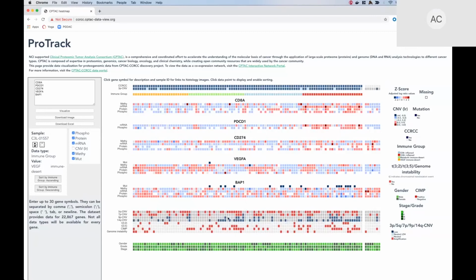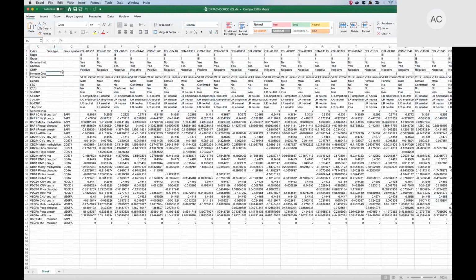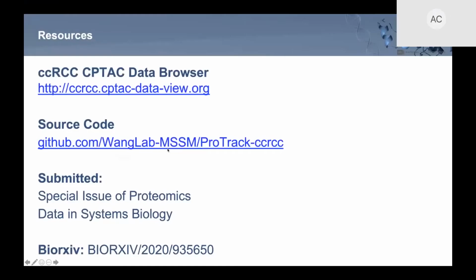And so this is ultimately an example of the very straightforward but hopefully very practical things you can do with this particular tool. Okay, so we've ordered this in a way that we find meaningful. If you download the Excel sheet, I'll show you what you actually get when you are trying to pull this data out. Specifically, you get those samples ordered in exactly the way that you determined was an interesting pattern for you. And then the same clinical tracks that you have here, the individual genes separated by their data type and the corresponding values.